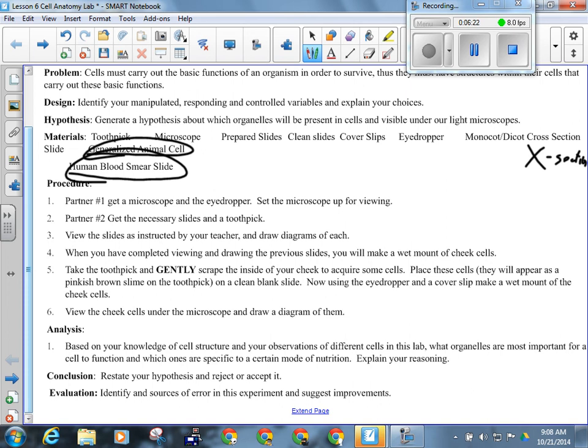So here's the base of your microscope, and you have to excuse my drawing ability, okay? Here's the light. The light kind of comes up from there. Here's the stage, and underneath the stage is what we call the condenser diaphragm, and it has a small little knob that comes off of it. If you adjust that knob by turning it, you close the iris of the condenser diaphragm. When you do that, less light comes in, but in a different way than dimming the light, and it improves the contrast of the image.